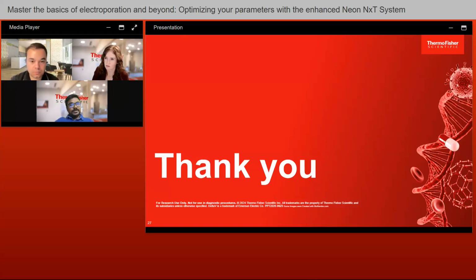And how we selected those programs is like this. For these programs, you can utilize any number between 100 to 2500 volts. In terms of pulse width, you can utilize any number between 1 to 100, and pulse number wise, you can utilize any number between 1 to 10.